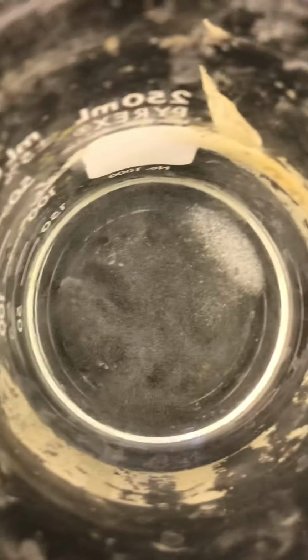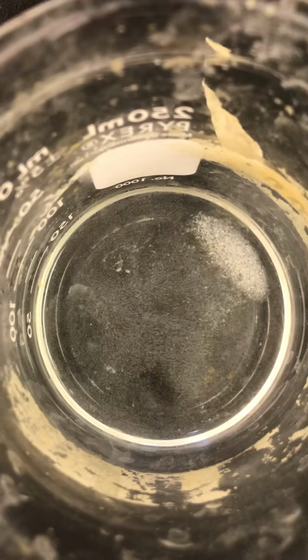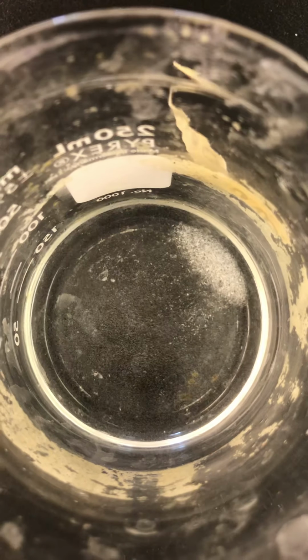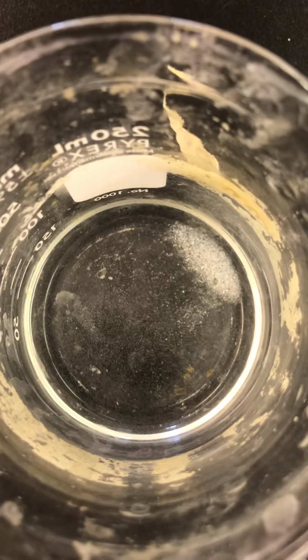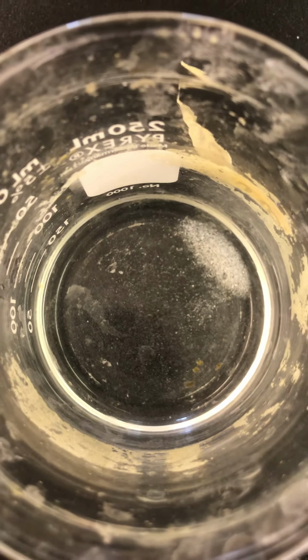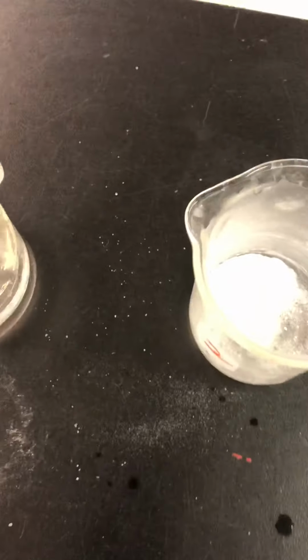And I'm going to show you from above. So if the majority of the solid is gone, then you would say it's soluble. Okay, let's move on to the next one.